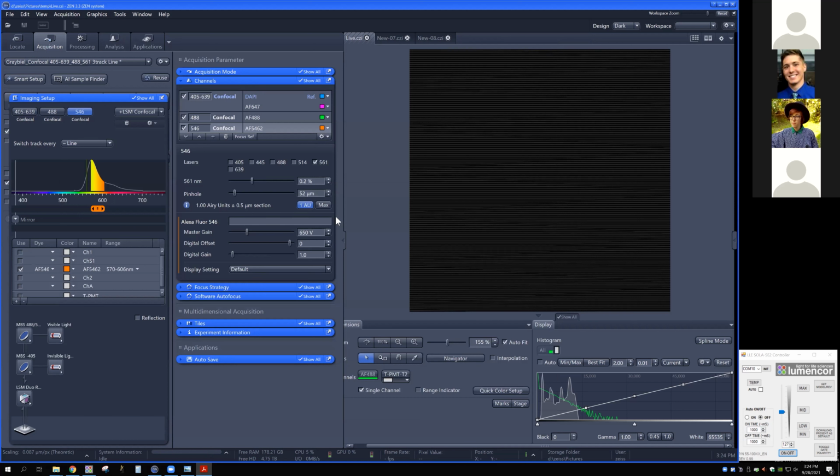So again, the purpose of this afternoon, to some extent, is to walk through a couple of different examples for fluorophores and to talk about different ways to configure those and set them up. And I think it's most helpful and most relevant if we do these with yours. So if somebody else has something that you would like to throw at me, we can talk about how you would build it. If not, then I'll switch gears and show you what the Airy Scan configuration would look like, because as a filter-based thing, it's a little bit different. And I can do that using this same example if we want to do it that way.